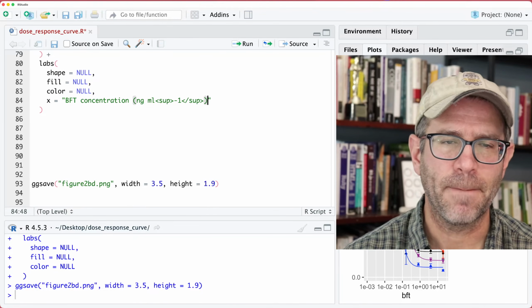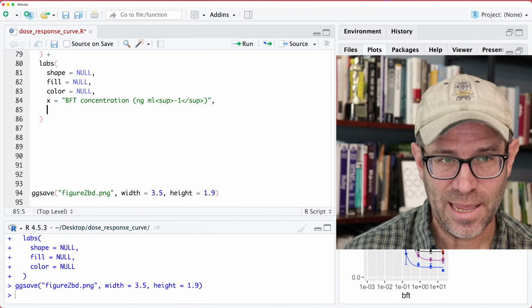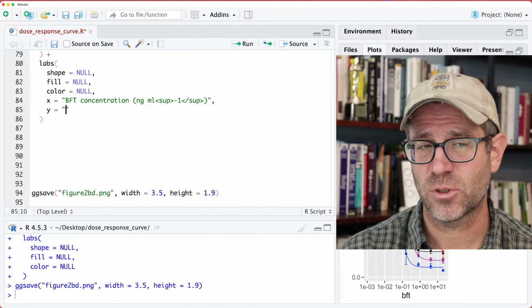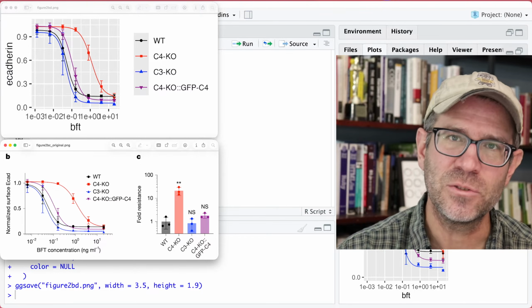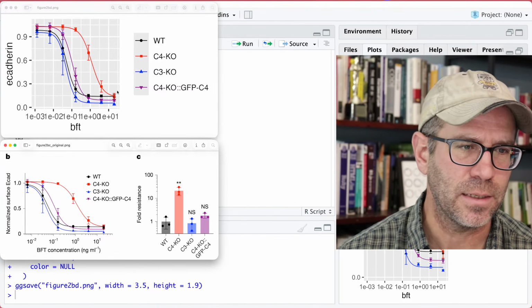There is built-in Markdown for superscripts and subscripts. I find that it works inconsistently, and I would just prefer to not have to mess with it. And so I use the sup for superscript or sub for subscript. And I find that that always works, if I'm using geom_richtext, or element_markdown rather, from ggtext. So we'll have to bring that in.